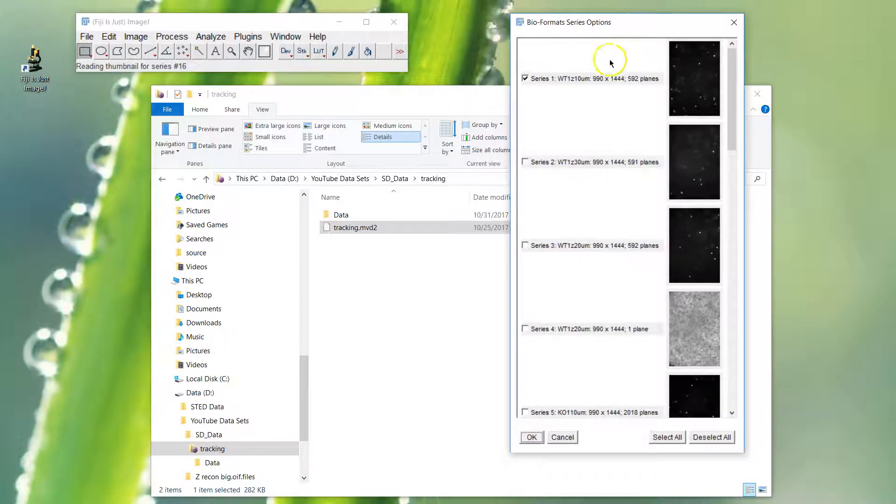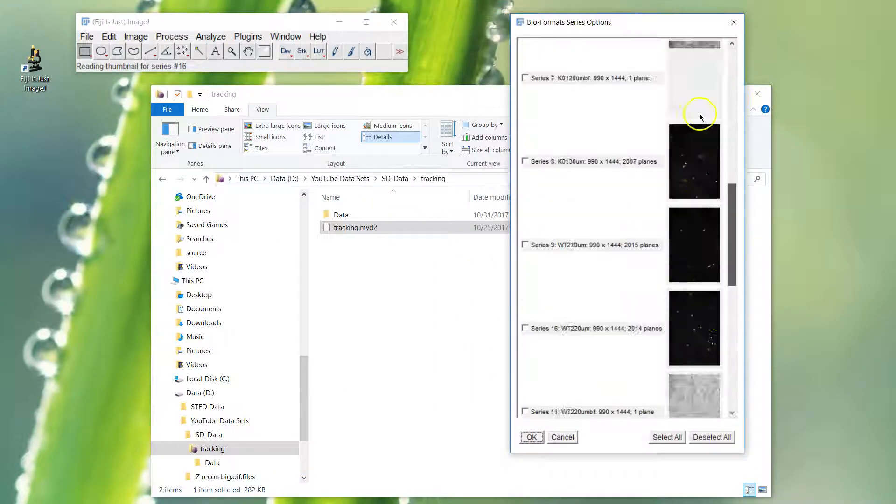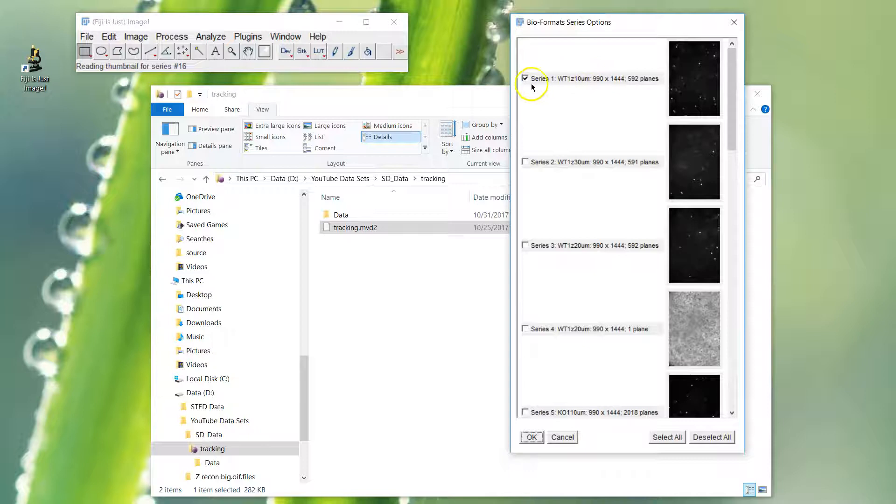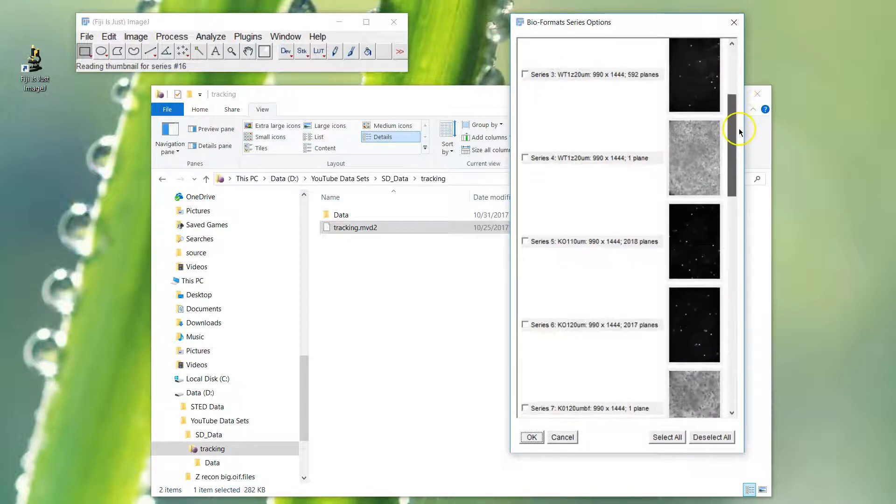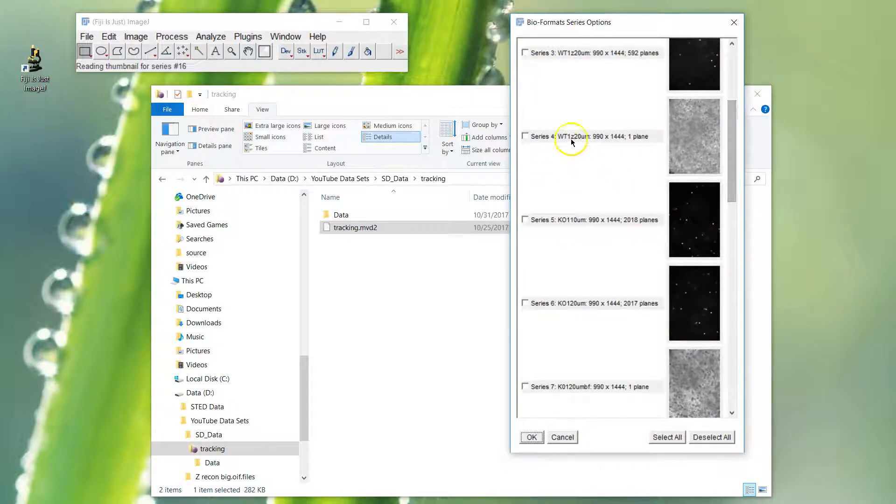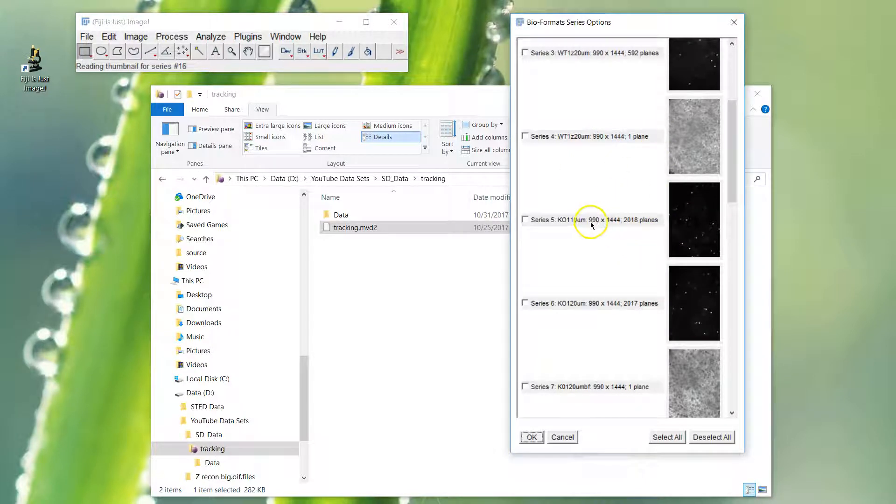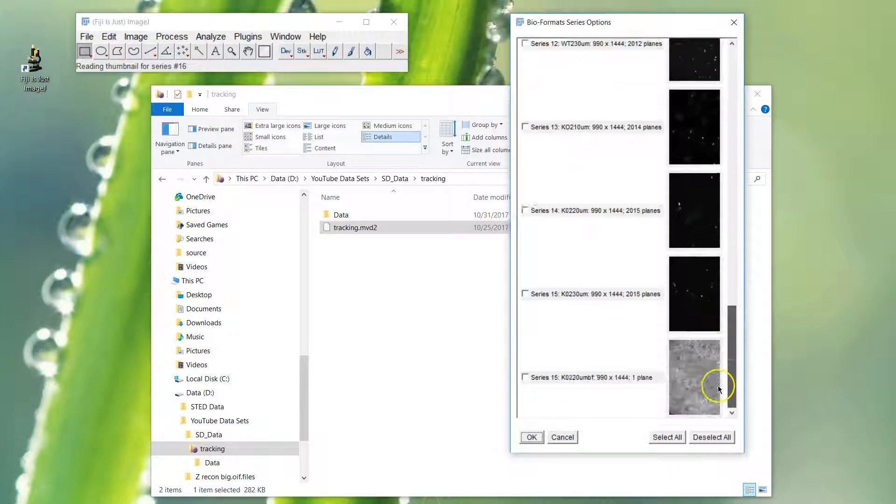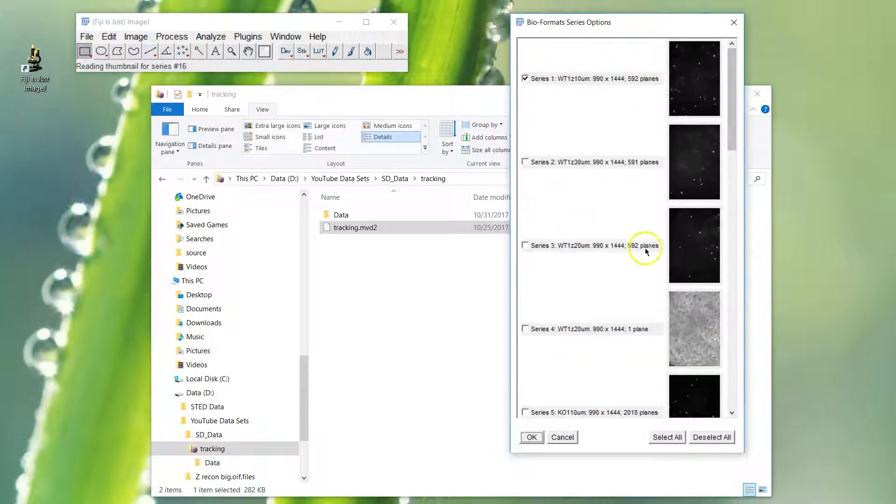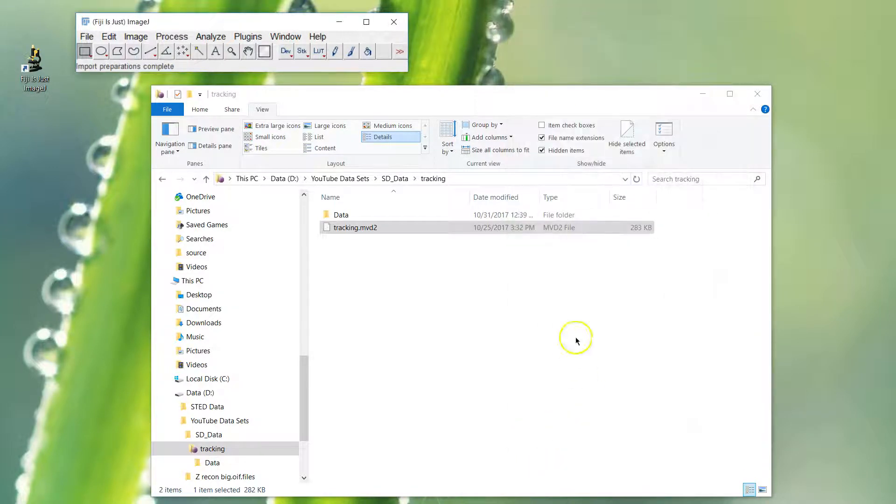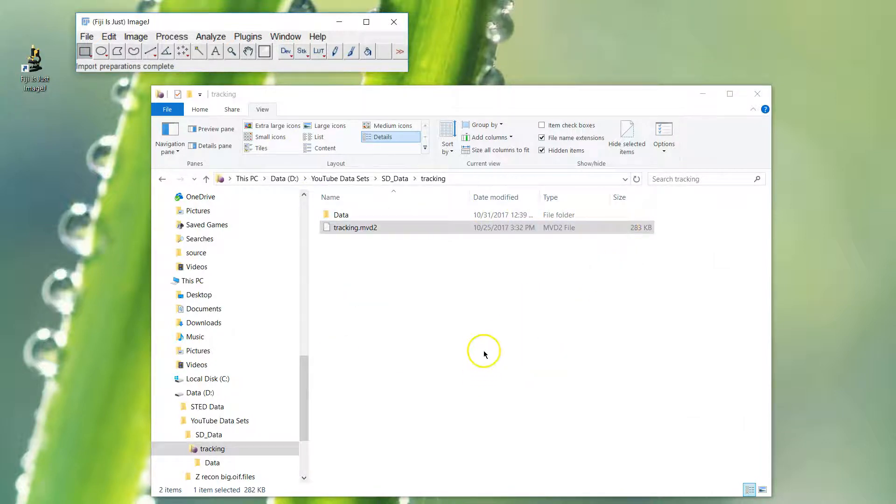Then it pops up a series option. You get this with .lif files too. It always selects the first one, so watch out for that - you can end up opening files as well. Pick the ones you want to do. You'll see a file name and a number of info stats you can use to pick out image size, number of planes, and things like that to help you identify which file it is. Just pick out the first one, click OK, and that will pull it in.